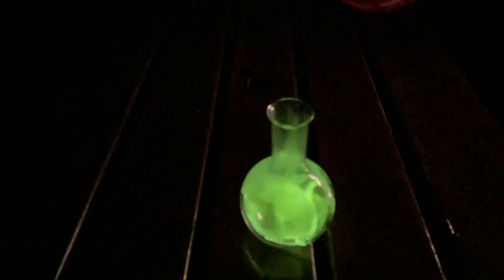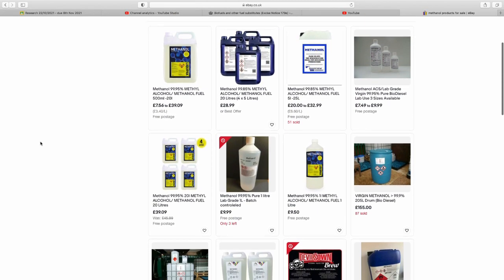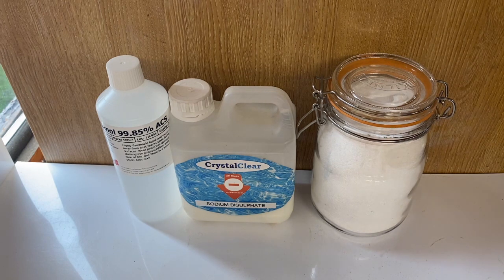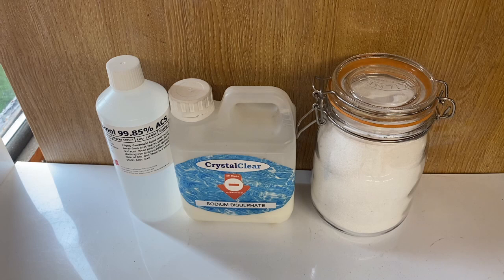In this video I'll be making trimethyl borate from three easily obtainable ingredients. Methanol is available on eBay for quite a low price. Sodium bisulfate is sold as a pH lower for pools and borax is sold as a cleaner.